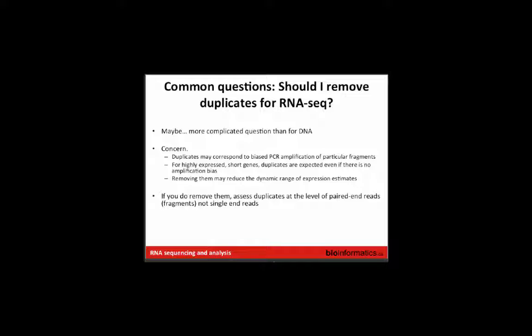I can't think off the top of my head of a tool that specifically looks for that pattern. There might be one that looks for this unusual spikiness in your data. But you could definitely develop an ad hoc procedure or metric for finding these things. It tends to happen with the bottom 25 percentile of product size range. When you see it, what we do is keep a list of products that we've seen in the past, and check that their numbers are related to something that doesn't tend to go nuts at the top end of our size range. We do a ratio. Sometimes you'll see this signature as well in a lot of the QC tools that do a k-mer analysis. You'll have certain k-mers, certain sequences, that in particular libraries are at very, very high levels for otherwise unexpected reasons.